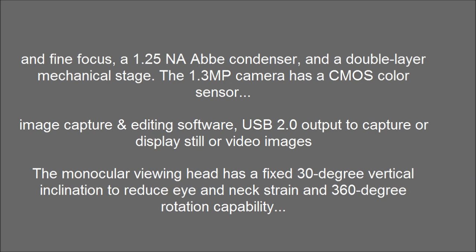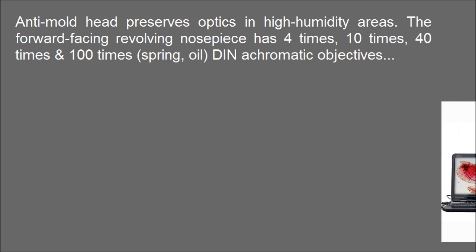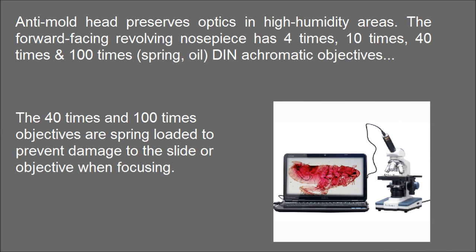The monocular viewing head has a fixed 30-degree vertical inclination to reduce eye and neck strain, and 360-degree rotation capability. The 40x and 100x objectives are spring-loaded to prevent damage to the slide or objective when focusing.